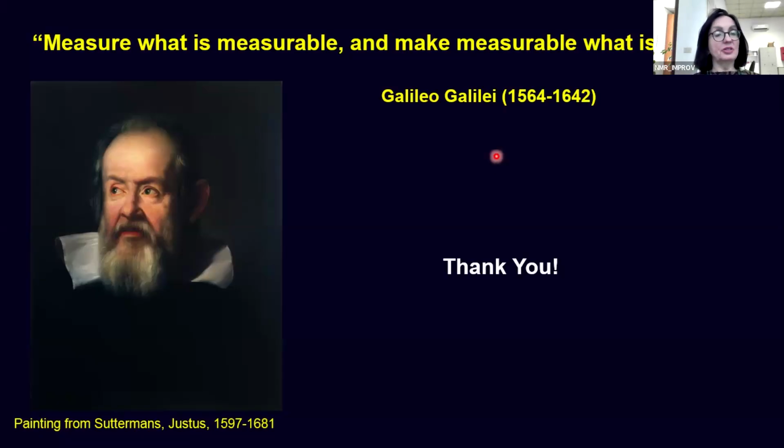Yes. Because for instance, I will put it in this way. You said that a lot of models are validated, yeah? Well, I mean, it depends what you mean by validation, because I do not question the mathematical principles, like, I don't know, the Fourier transform of an exponential function is Lorentzian, or something like this. But just going into mathematical properties, I can have several relaxation terms. Usually, actually, specifically for liquid crystals, I was arguing for a long time with Pedro about this. You have many components, like you have a component for every single piece of the profile.